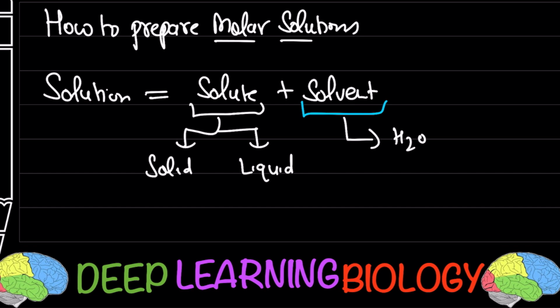Most of the time in laboratory we are going to prepare molar solution using some solid chemical. Today we are going to learn how to prepare these molar solution.